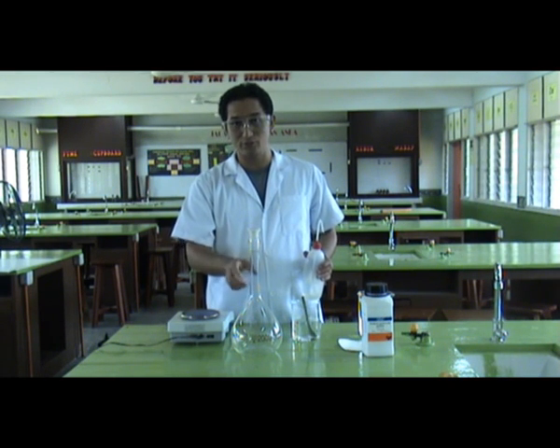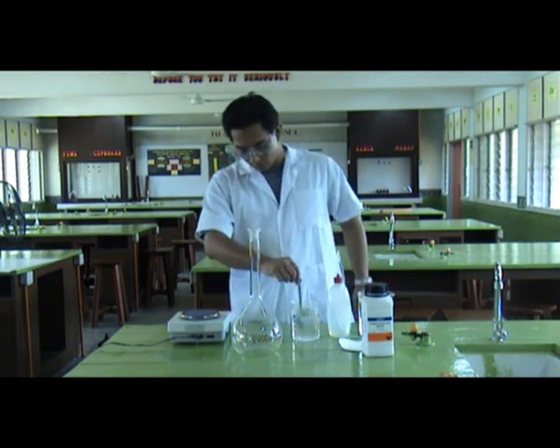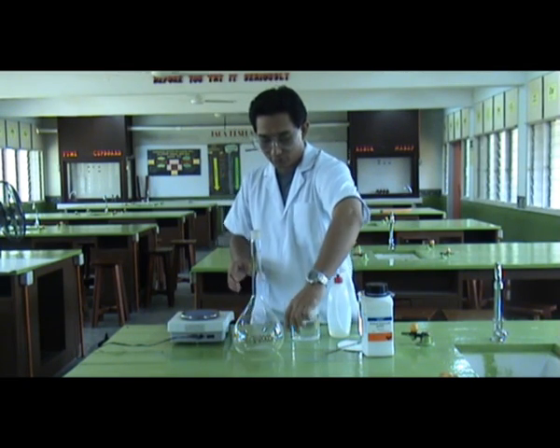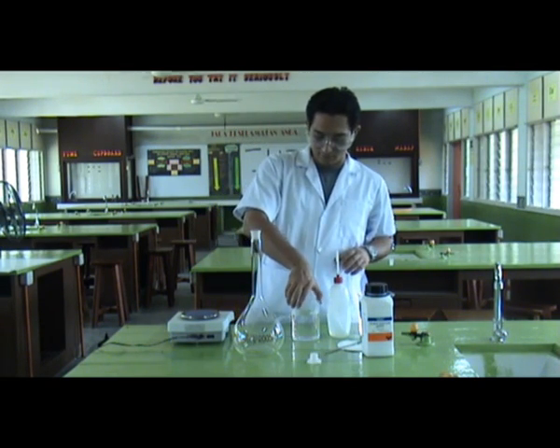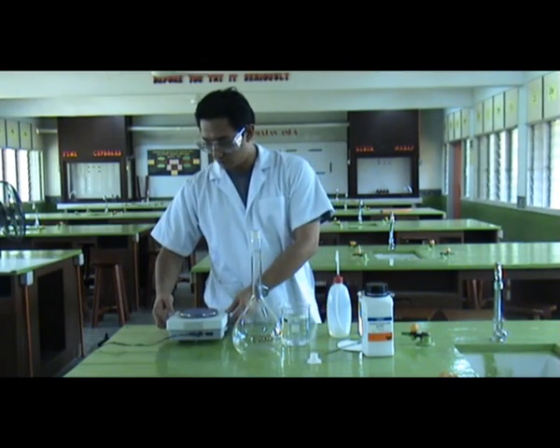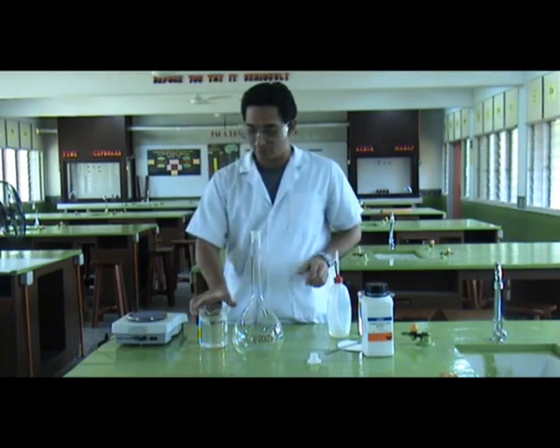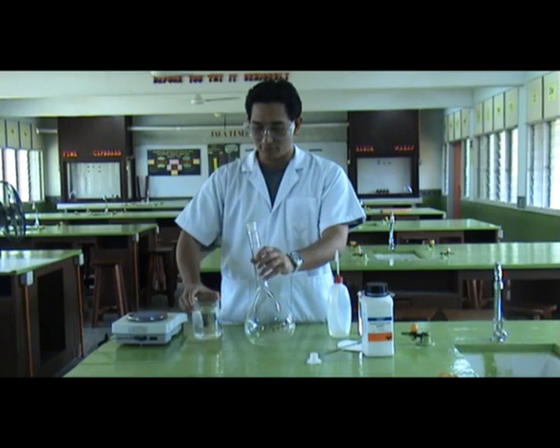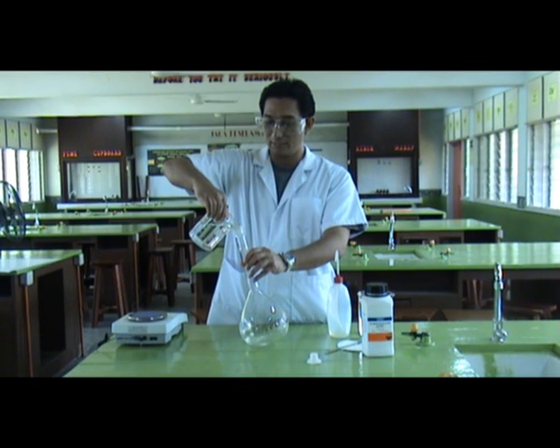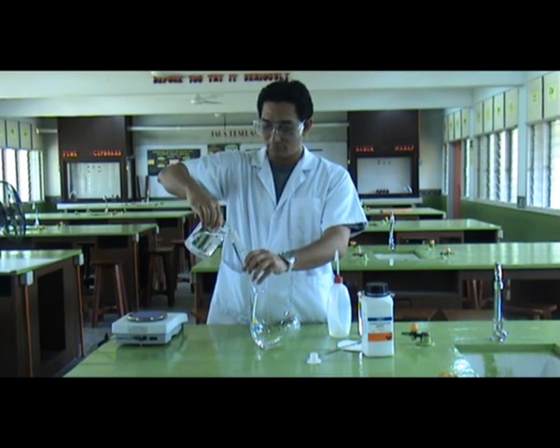Then we pour it into the volumetric flask. We have reached 500 ml of diluted sodium hydroxide. Be very careful when pouring this solution into the volumetric flask — remember to pour it gently and slowly. You can still feel the heat from the reaction — it is very hot.